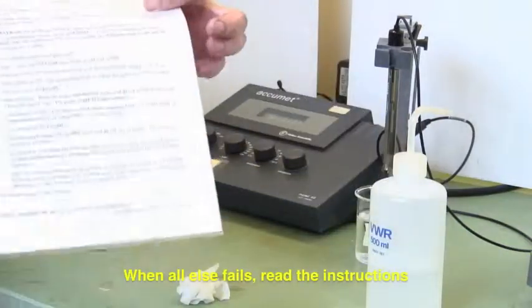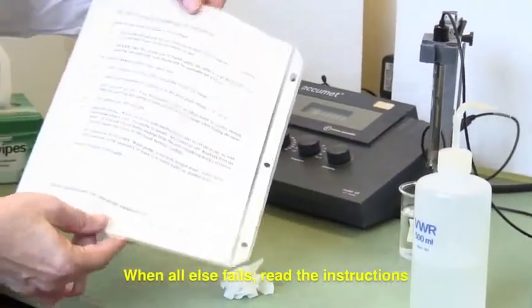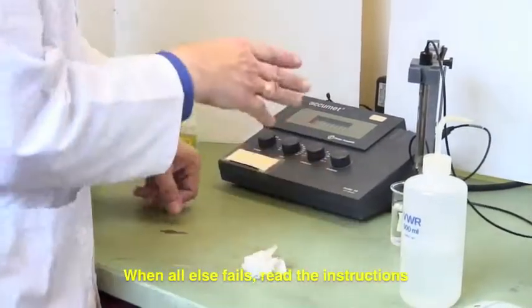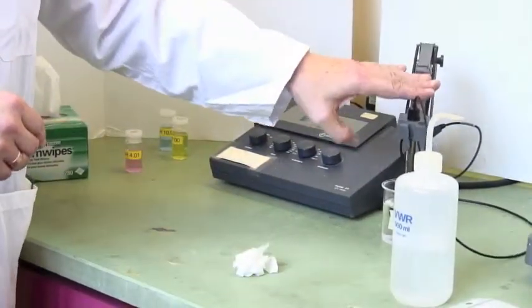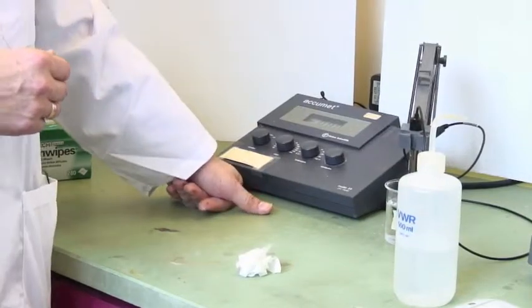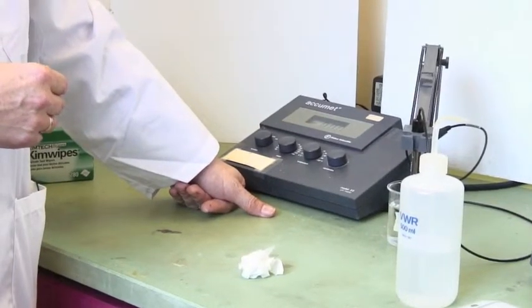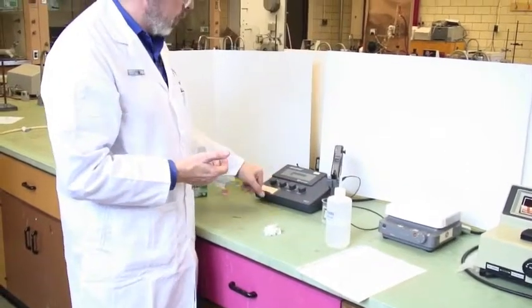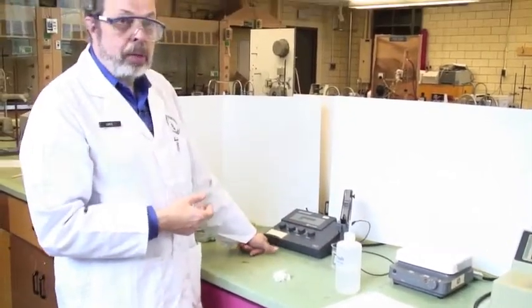If you forget, instructions for standardizing the pH meter are always nearby. To read pH, place your solution under the electrode, turn to pH mode, and read the display.